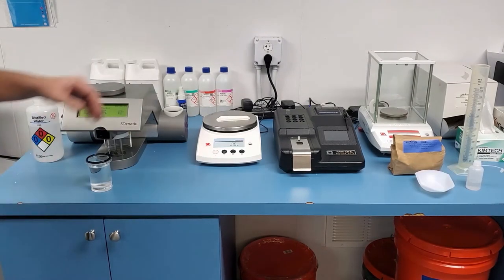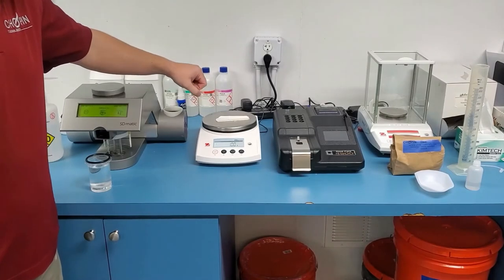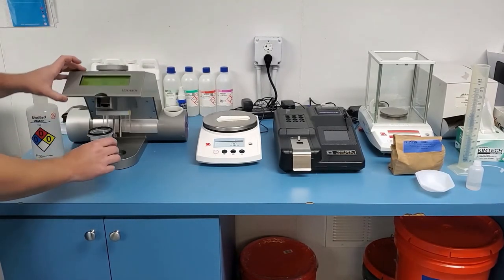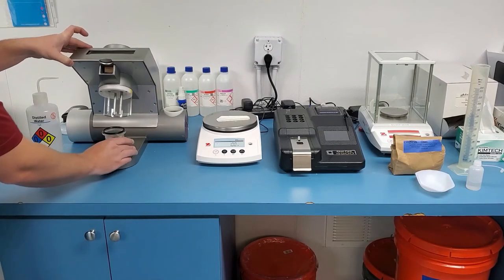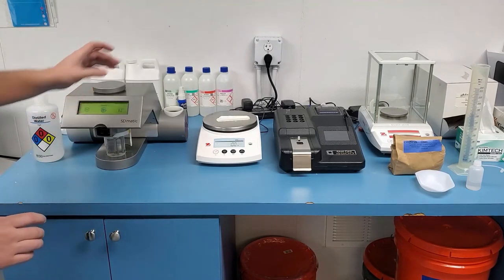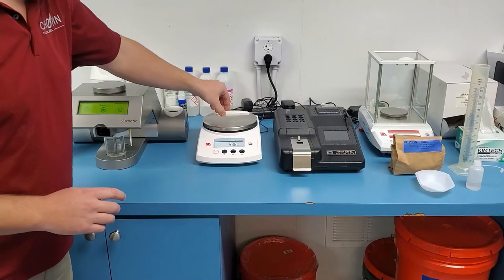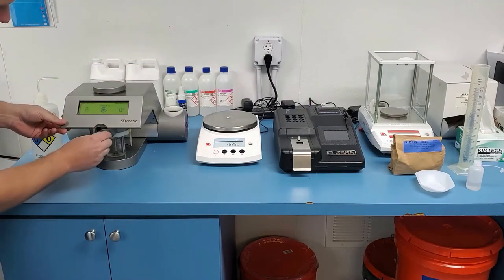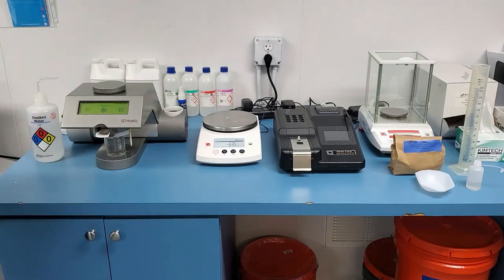In order to start a test, you're going to weigh out 1 gram of flour onto the flour spoon, and you're going to place the reaction bowl with all your chemicals underneath the device. After your flour is weighed, you will carefully take the flour spoon and insert it directly under the screen into the metal slot. At this point, all you need to do is press test on the screen.